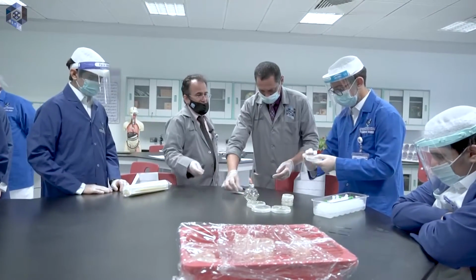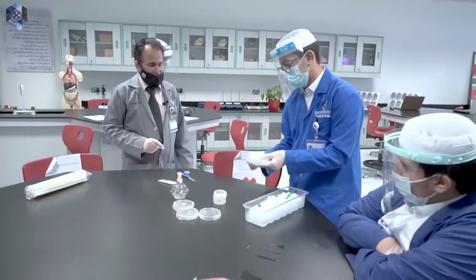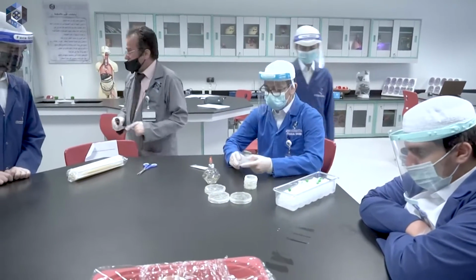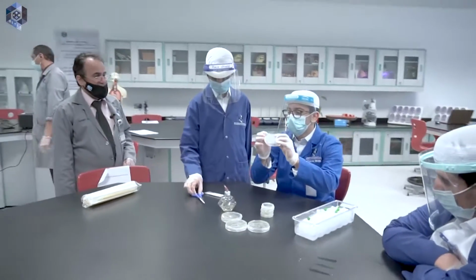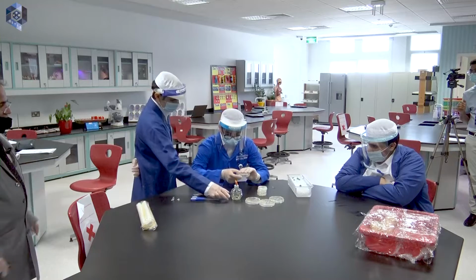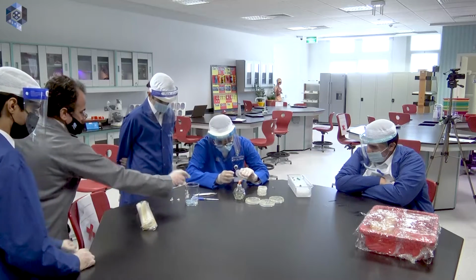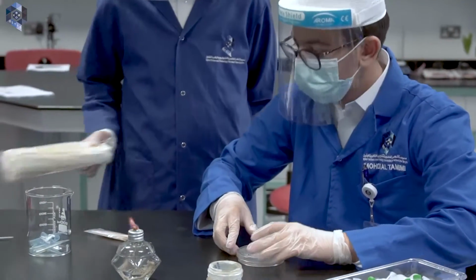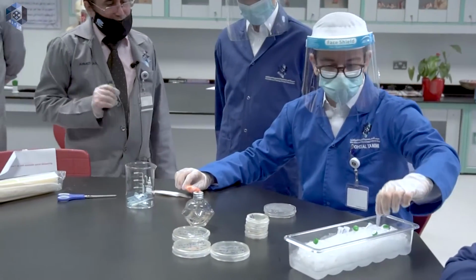Yes, remove the parafilm. No problem. Bring the beaker for the disposable things. Remove the parafilm. Try keeping the plate on the bench, closer to the waste. Place the waste here. No, don't use this for now. You use the toothpicks. Now, you will do what?